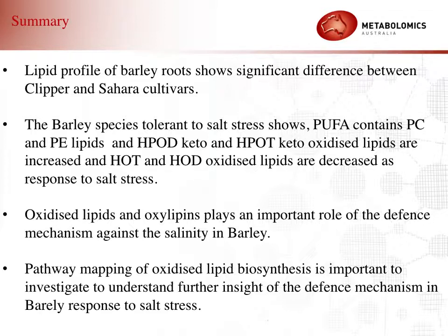So, as a summary, the lipid profile of barley root shows a significant difference between Clipper and Sahara cultivars. The barley cultivar tolerant to salt stress shows PUFA, polyunsaturated fatty acid, containing PC and PE lipids, and HPOD keto and HPOT keto oxidized lipids are increased, and HOT and HOD oxidized lipids are decreased in response to salt stress.